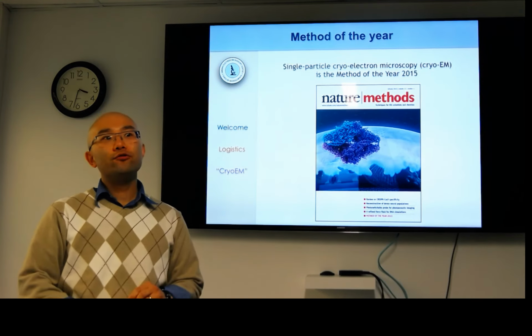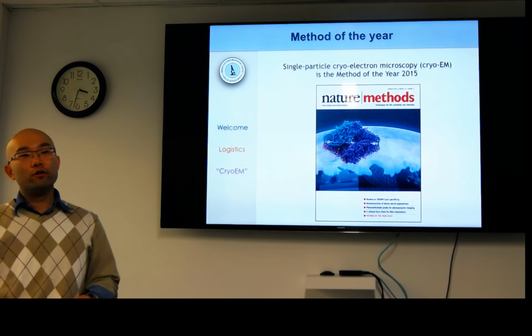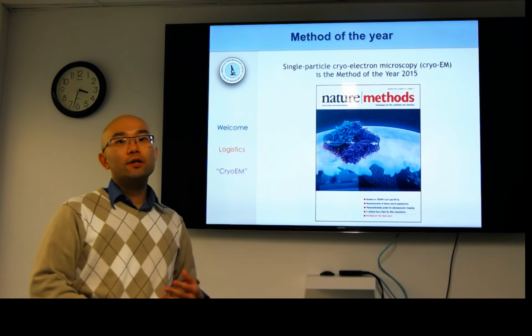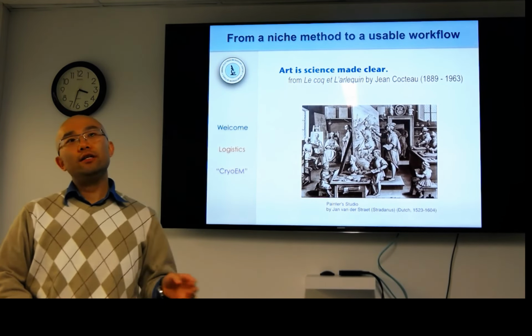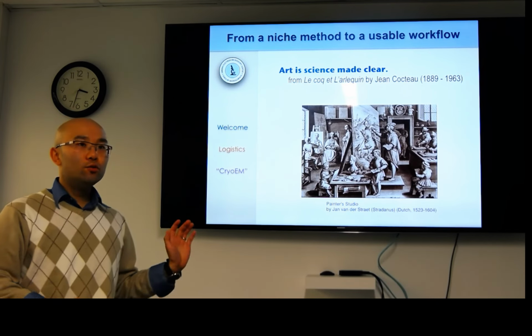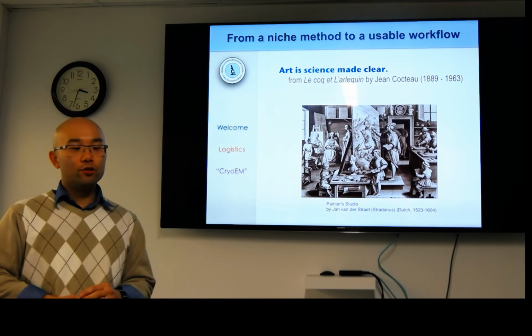A lot of interest has been growing in the field of Cryo-EM. In particular, a lot of people consider Cryo-EM single particle EM, but EM is more than just that, and we'll get into that. It was the 2015 Nature Method of the Year. However, we want to move the field from a niche method to a very usable workflow for others to use.